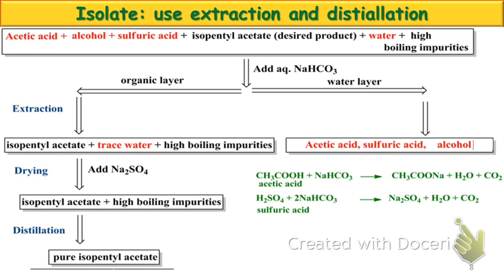HCO3 acts as a base. Okay? Can act as a buffer in particular conditions. So we're adding a base in this case, a water-soluble base. So we're going to see two layers form. You've got your organic product, which is going to be relatively water-insoluble. No hydrogen bonding. Okay? We just have dipole-dipole forces and a lot of alkyl structure to it. So it's going to be insoluble in that layer.